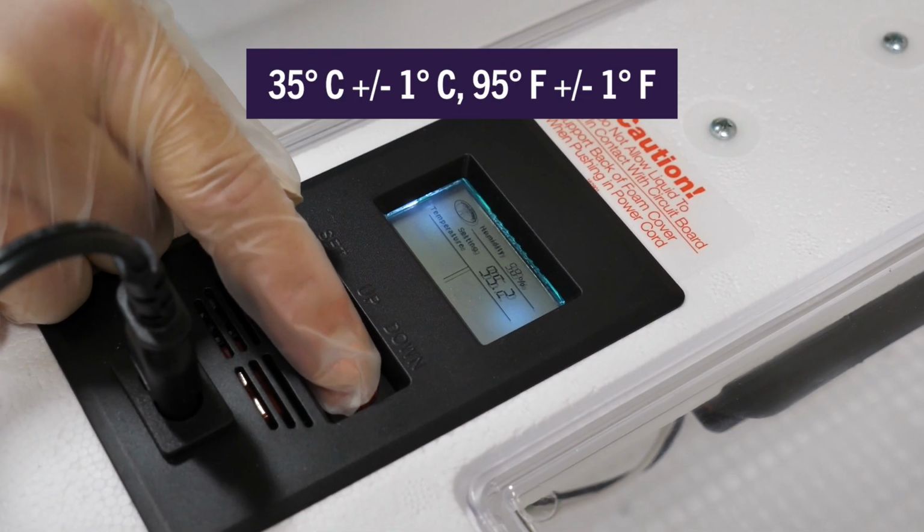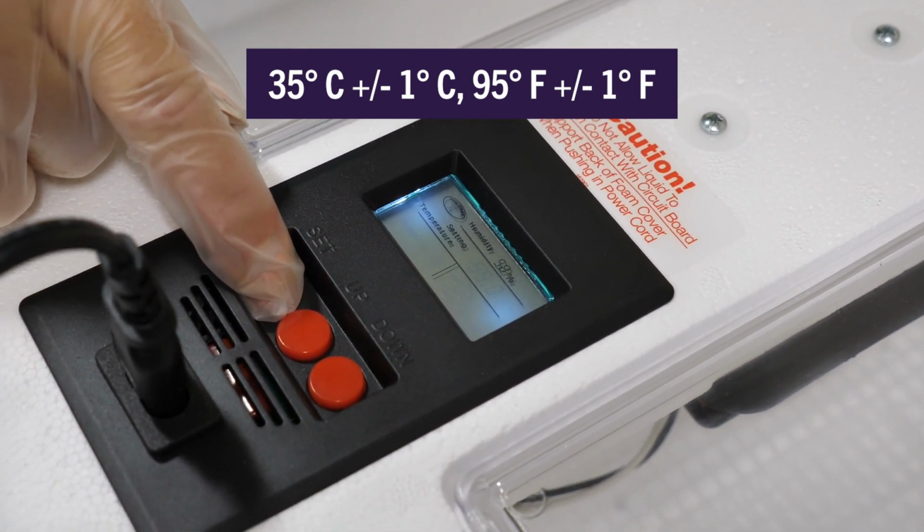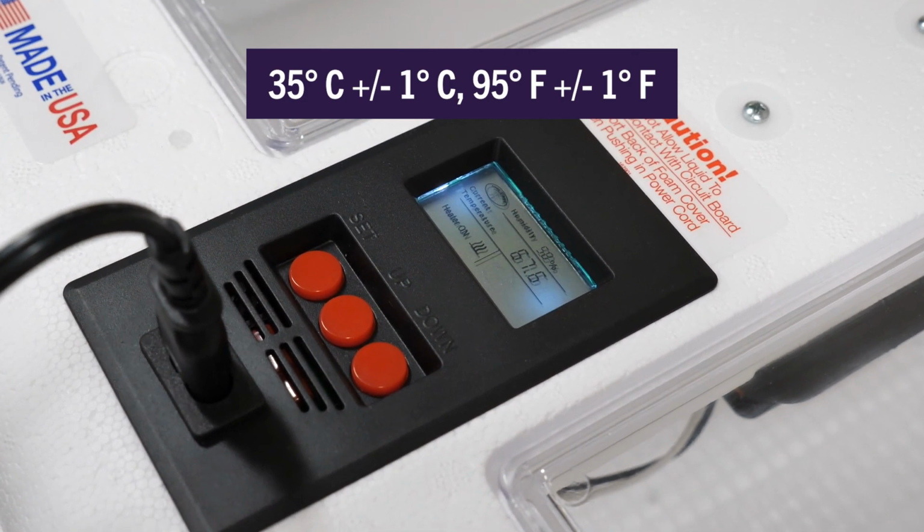When you're ready to start the incubation process, you'll need to have your incubator at a stable temperature of 35 degrees Celsius or 95 degrees Fahrenheit, plus or minus 1 degree.